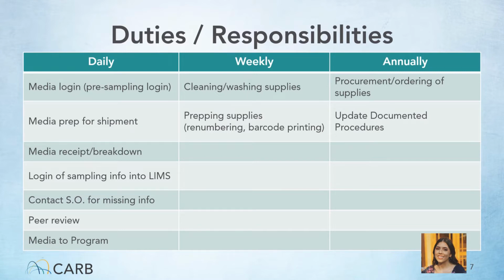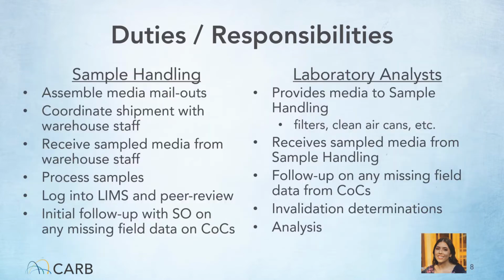And on an annual basis, sample handling restocks certain supplies such as temperature indicators, denuders, blue ice, things like that, to hold us over for the following year. We also continually review our procedural documentation to ensure that it is up to date. These documents are helpful in training new employees and provide consistency amongst team members in carrying out our processes.